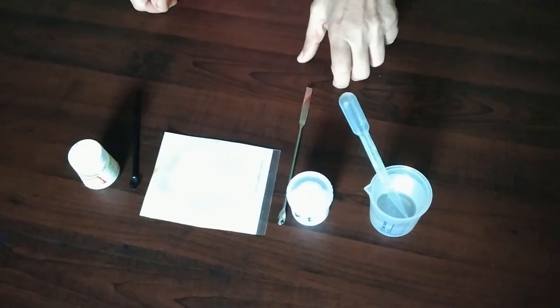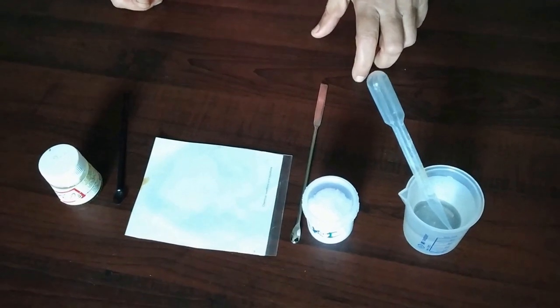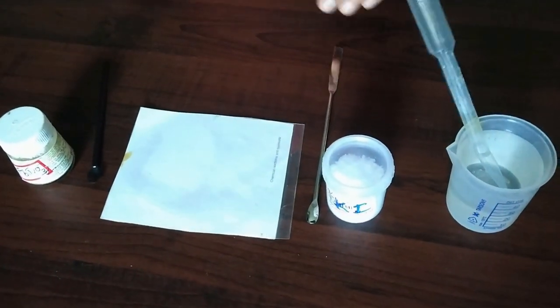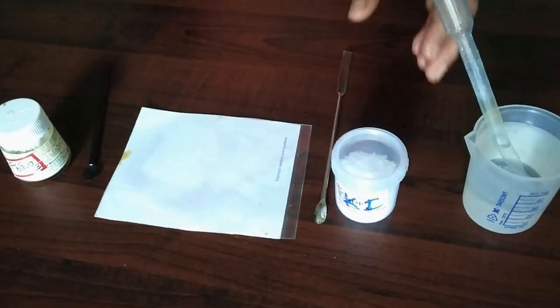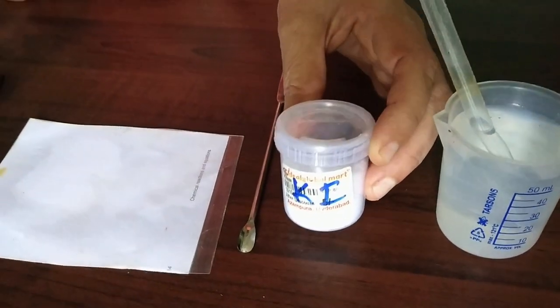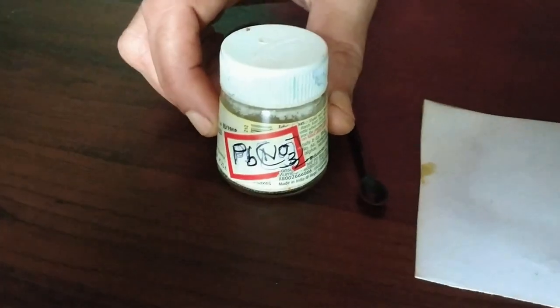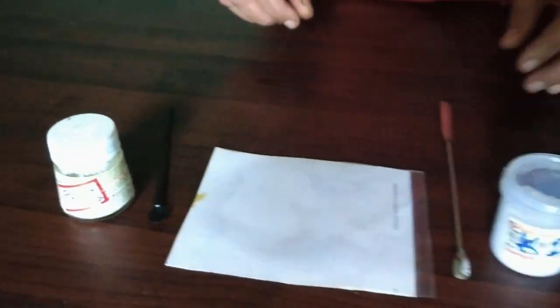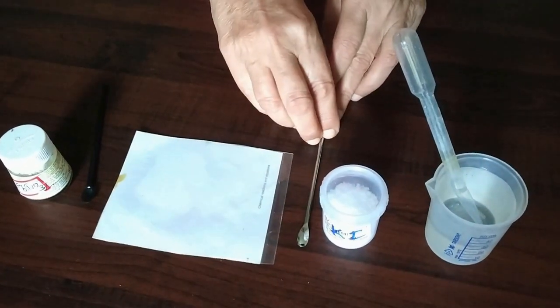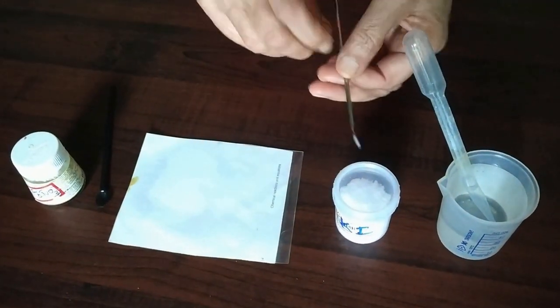Teachers, the next microscale experiment that we are going to see is displacement reaction. That is a double displacement or double decomposition, what we call. And this experiment can also be used to explain diffusion. I have here taken potassium iodide and lead nitrate. You can take even barium chloride and sodium sulfate, silver nitrate and sodium sulfate, anything that we can use for double displacement reaction.